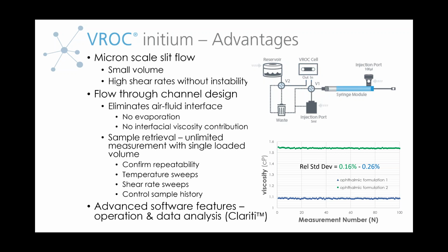Also, the system is closed, and the flow-through channel design eliminates the presence of an air fluid interface, which you have in, say, a cone and plate rotational instrument, or any rotational instrument for that matter. So you're not going to have issues with evaporation.